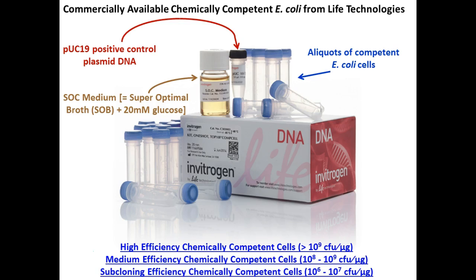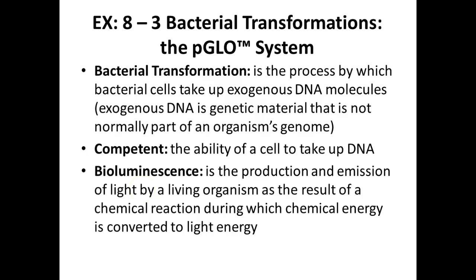So I was able to put DNA from frogs into bacteria, get them to copy it for me, so that then I could run it on the sequencing machine and find out the sequence of the DNA. This type of work is done all the time, especially in genetics labs. This stuff would be kept in the freezer, and I would run through a very similar process that you are going to do today with my samples. But I did a whole bunch more than you guys did.